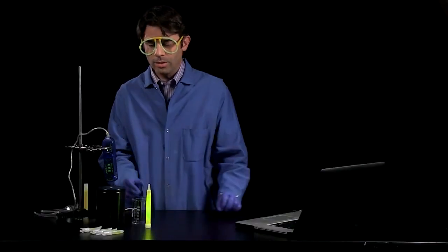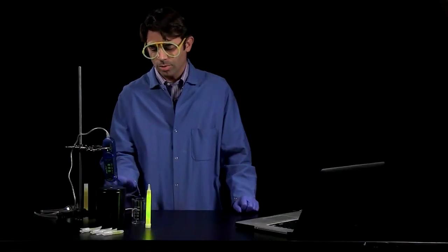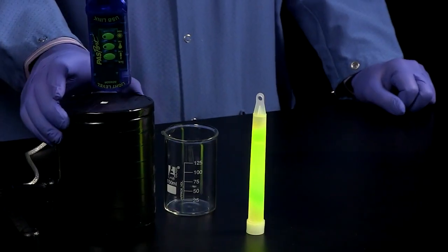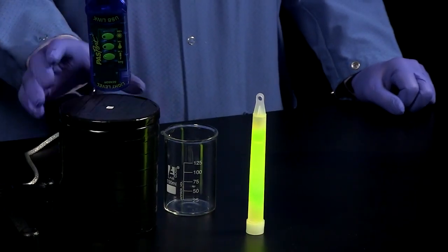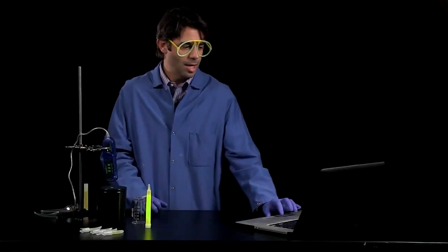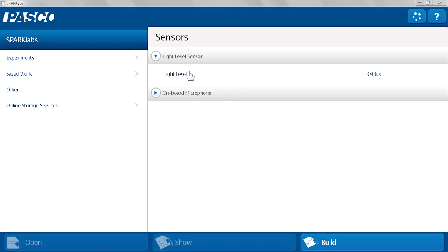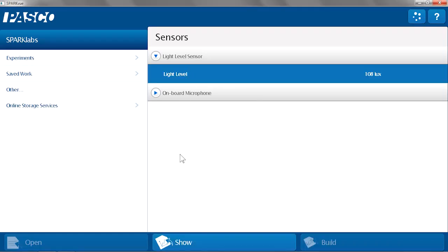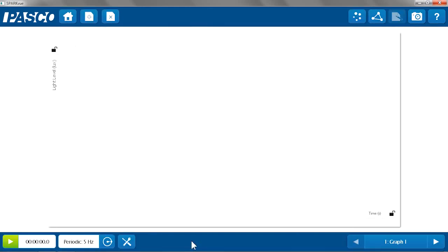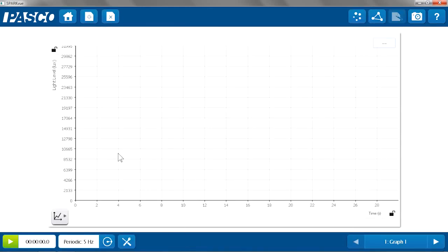To study that using our light level sensor, we're going to do that in a darkened vessel, and we're going to use SparkView. I'm going to set up SparkView to show the light level on a graph.